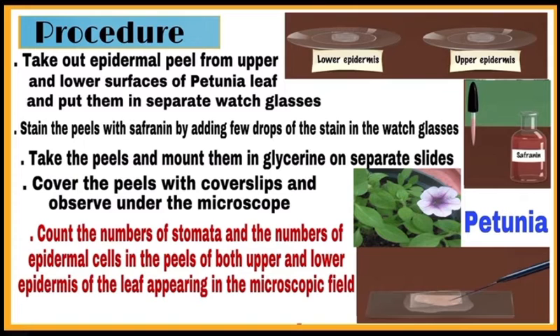Come to the steps of procedure. First, take out epidermal peel from upper and lower surfaces of petunia leaf.